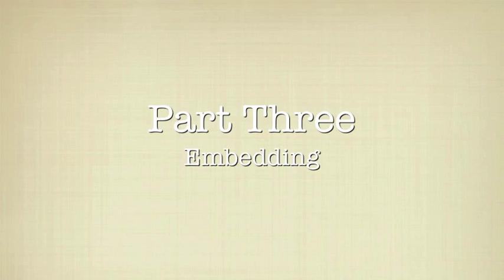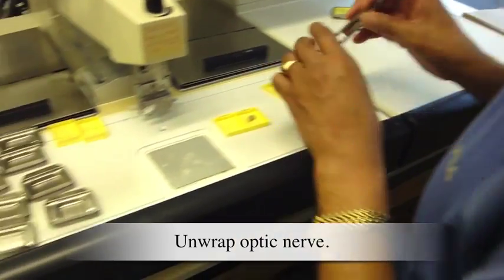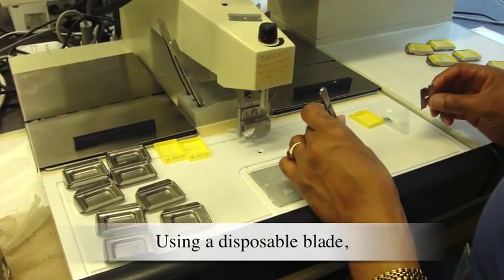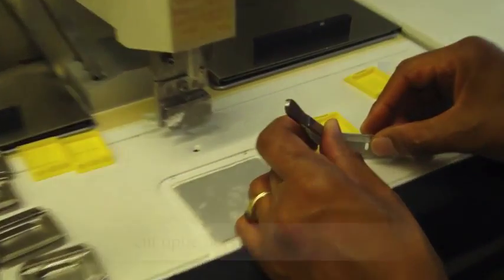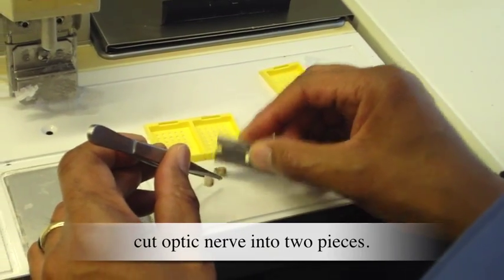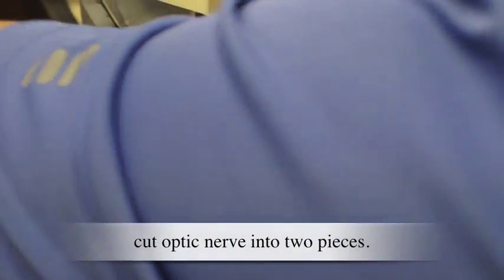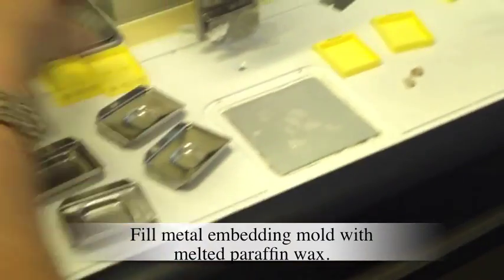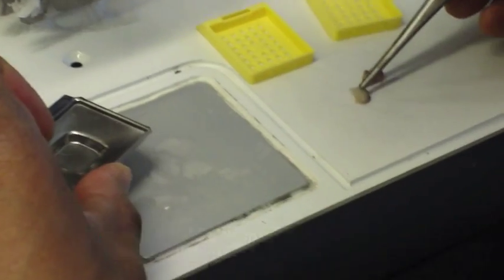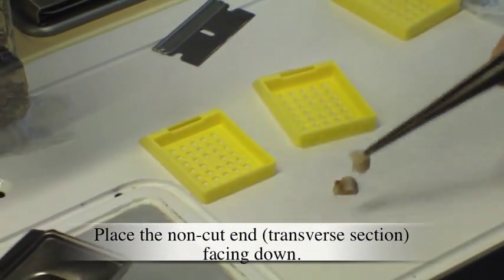Part 3: Embedding. Unwrap the optic nerve. Using a disposable blade, cut the optic nerve into two pieces. Fill a metal embedding mold with melted paraffin wax. Place the non-cut end, transverse section, facing down.